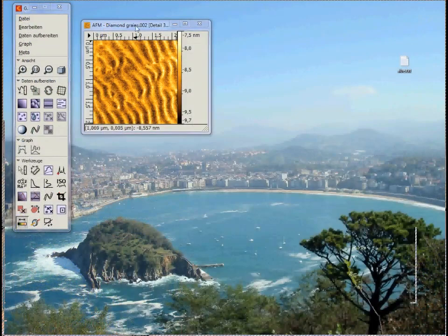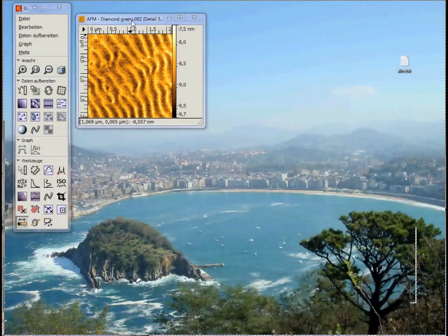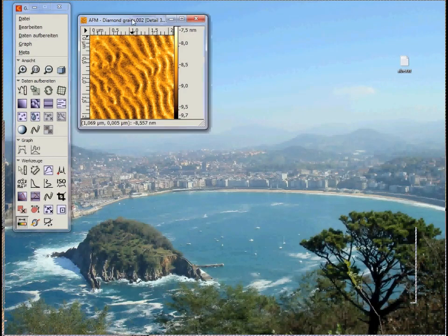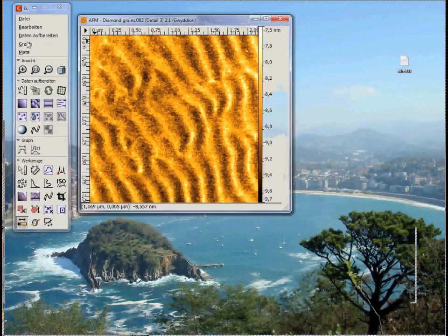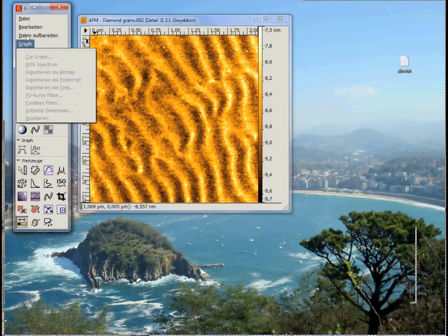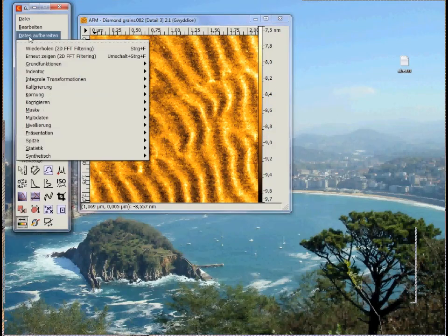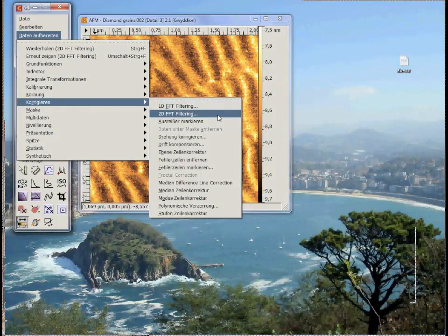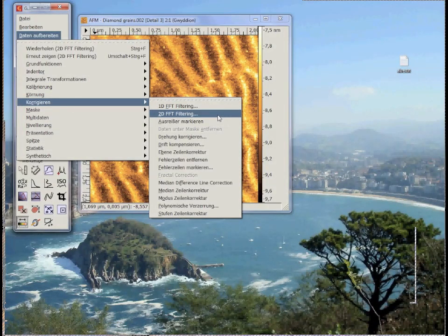Now I will show you a very cool feature, the Fourier filtering. With this one you can filter different frequencies out of your picture. Regarding the last example, with this technique you can split the information about the waves from the information about the surface roughness.